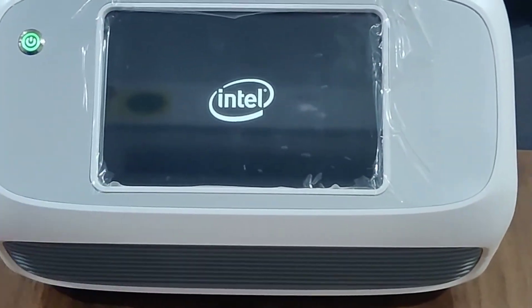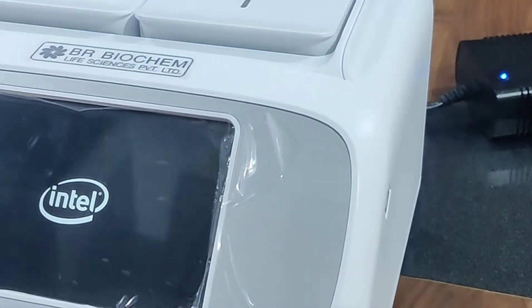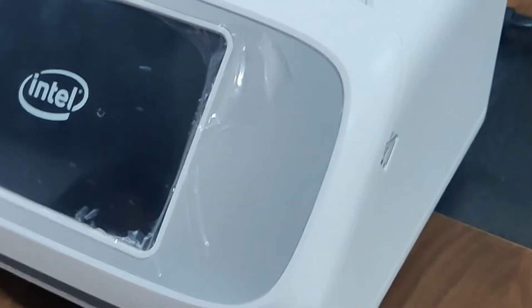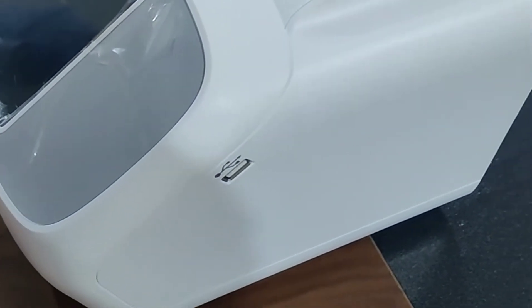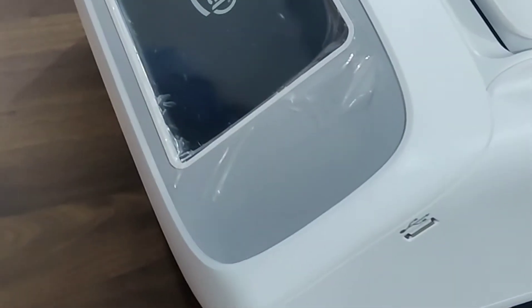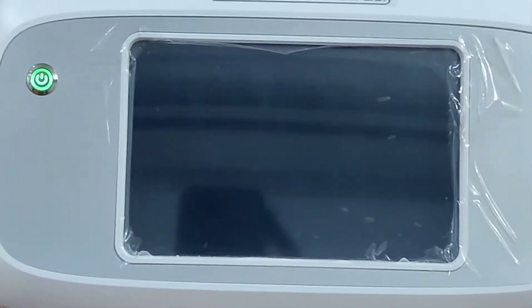The display shown here — this RT-PCR machine adopts dual channel and dual A12 blocks, which can run two different files simultaneously. This product combines a variety of advanced technologies, including a 7-inch high-definition TFT color touch screen display.